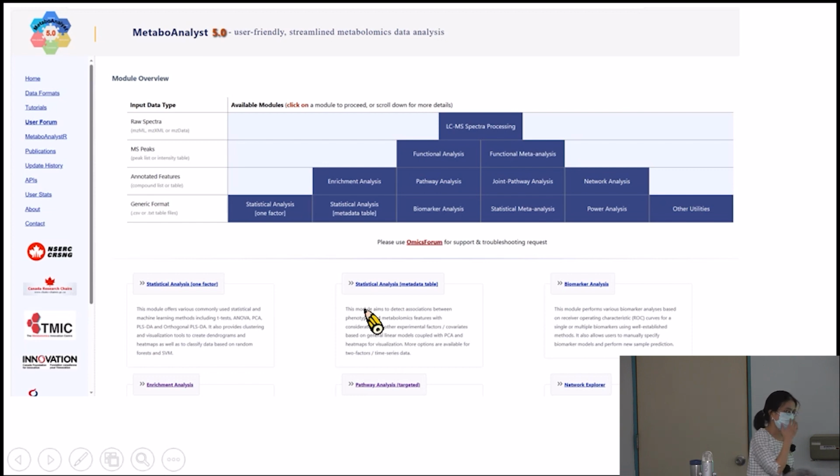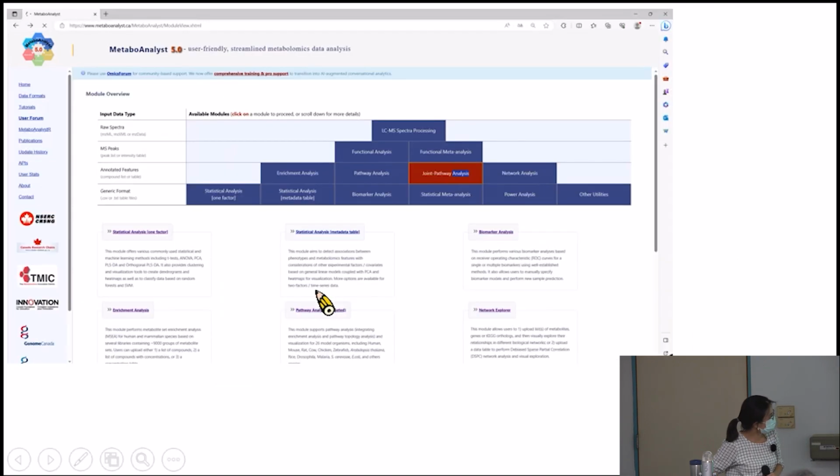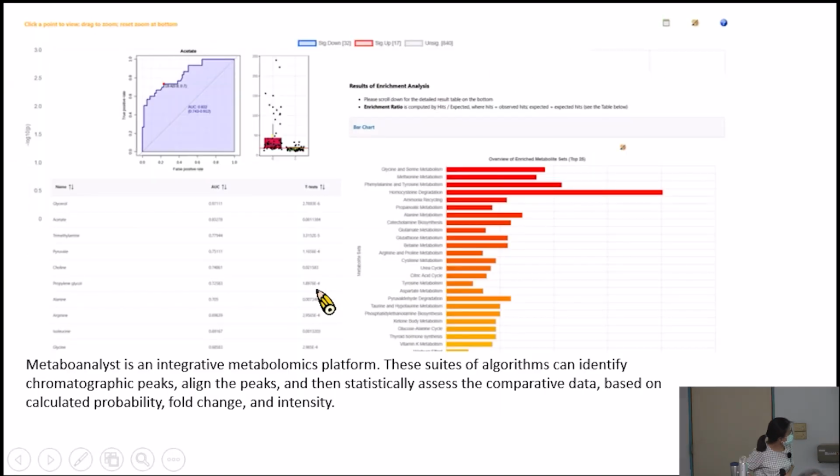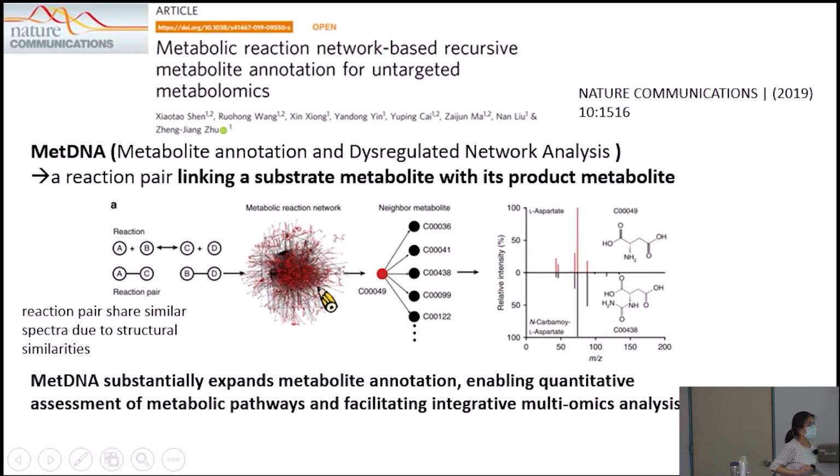I have another question, on page 21. A single compound can have multiple peaks. I don't understand why a single compound with one molecular weight can give multiple peaks.